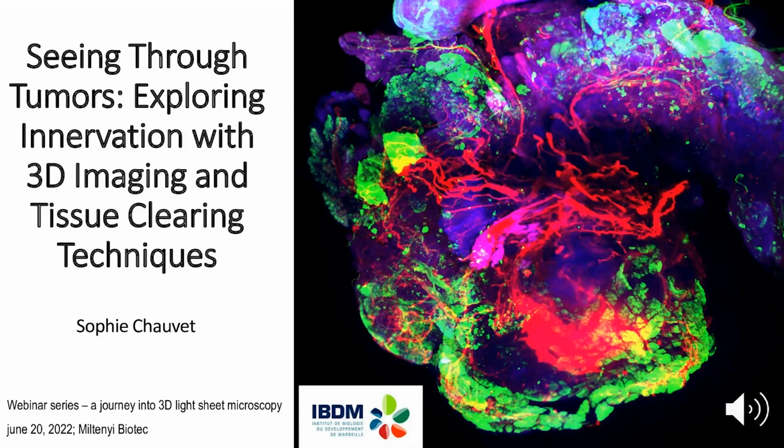So to recap that one, in relation to the iDISCO clearing method you discussed, are there alternative clearing methods that can be used for clearing pancreas or similar organs? And what is the typical duration of the clearing process?